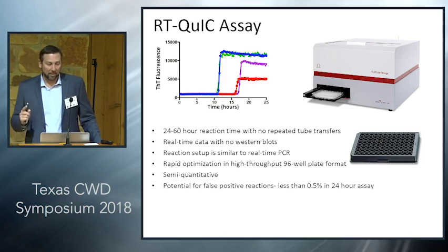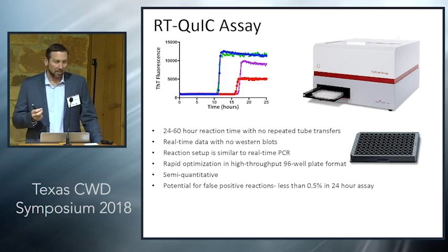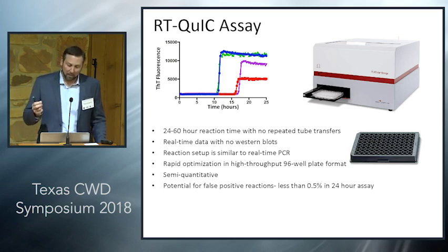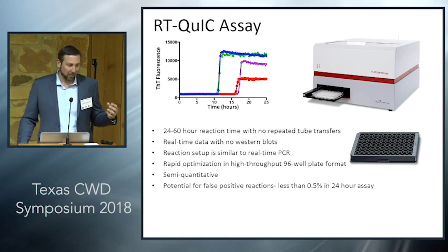One of the other aspects, actually I forgot to mention this about PMCA. RT-QuIC uses a Syrian hamster protein, which is not deer protein. However, it's very, very sensitive to the conversion of CWD, whereas with PMCA, the substrate has to match the seed. However, you can tell strain differences with PMCA. So if you were investigating strains from different areas, you could differentiate that with PMCA, since it more accurately represents the disease process.